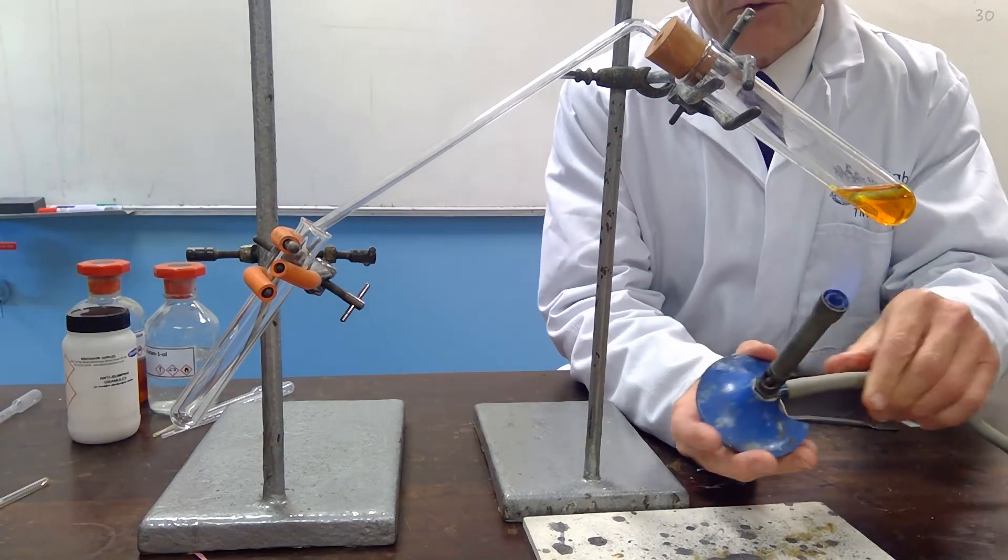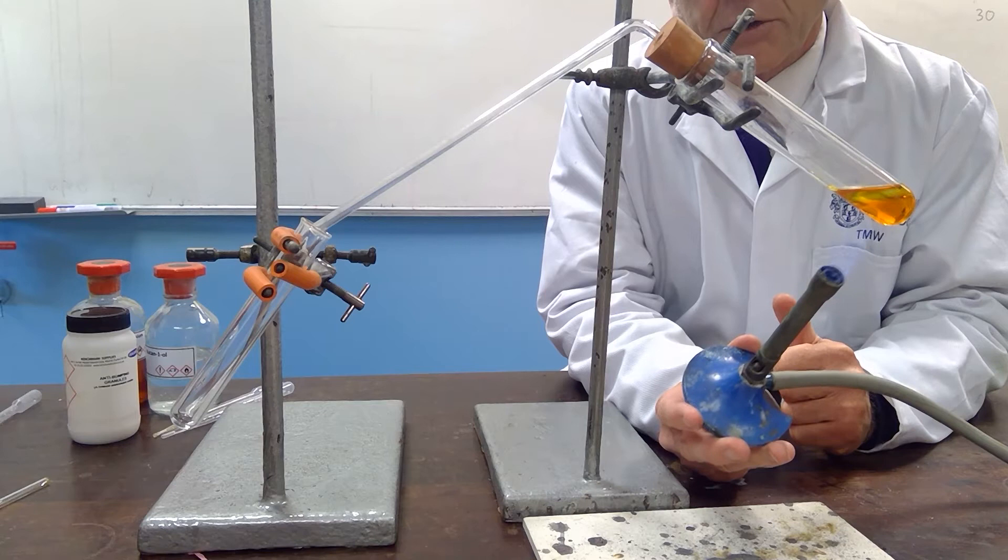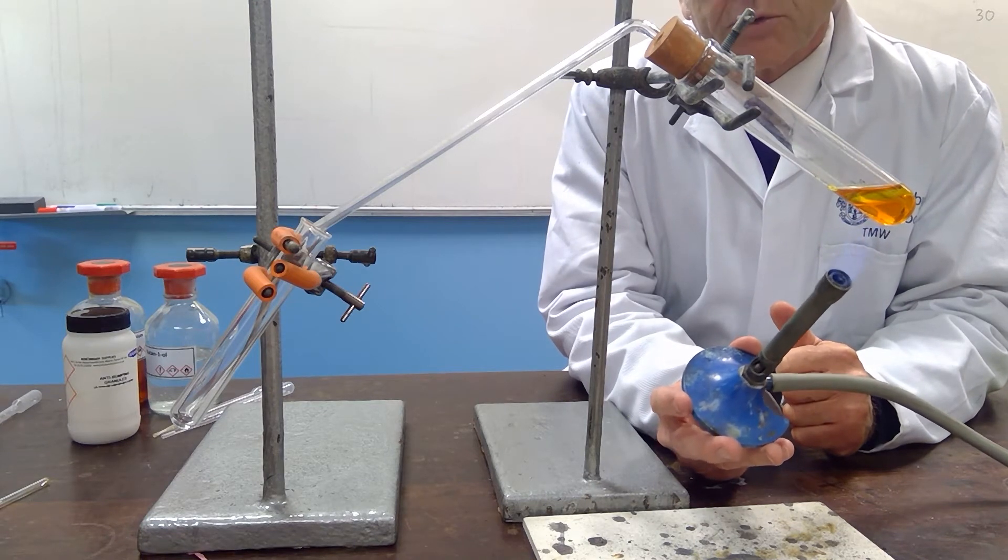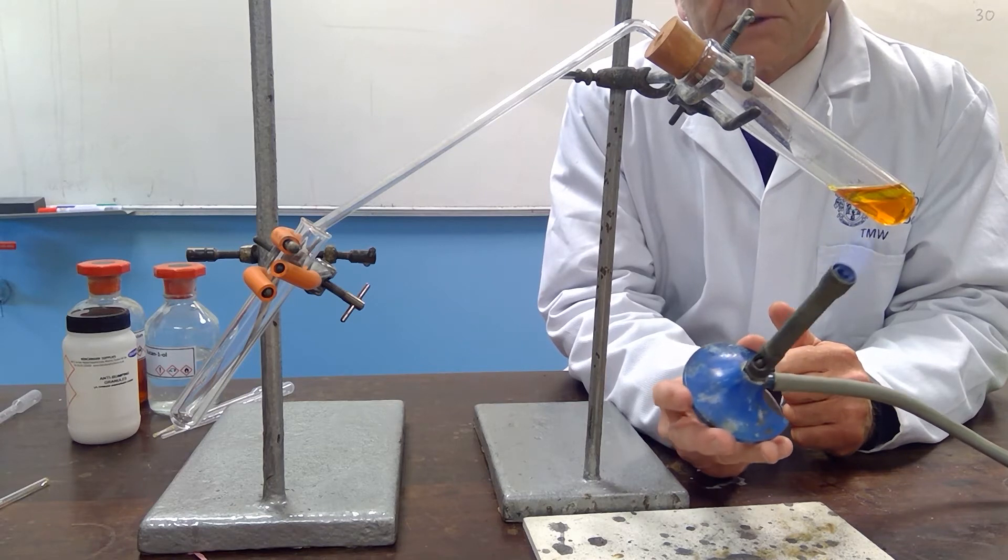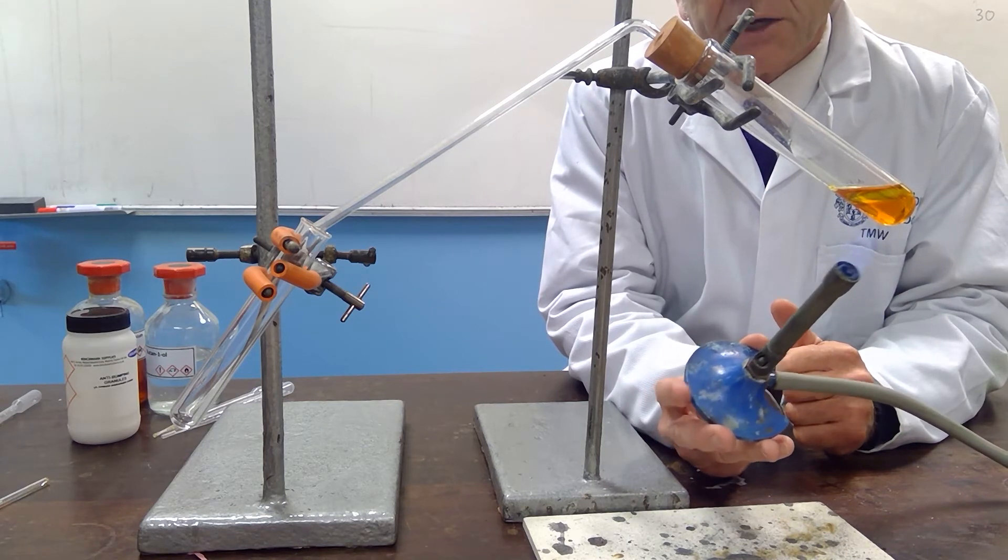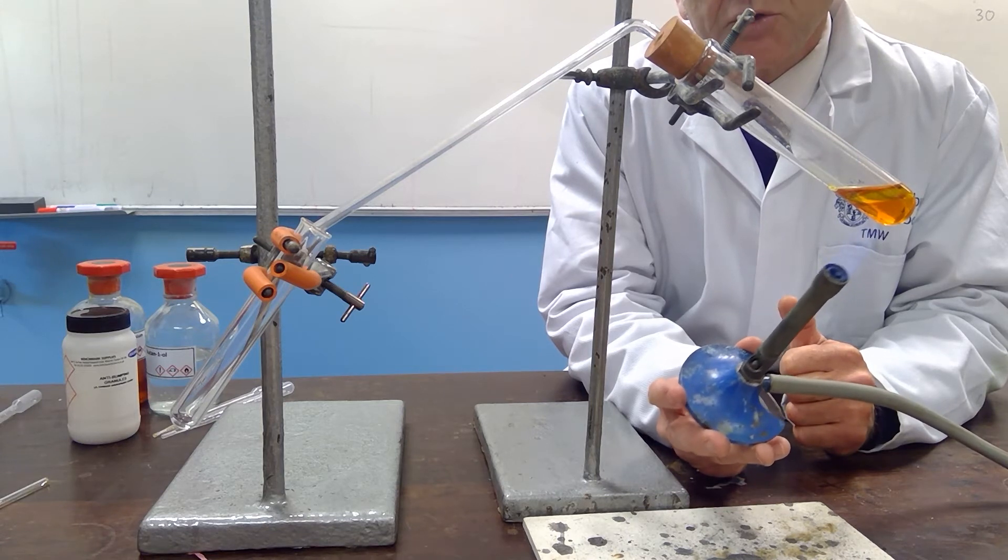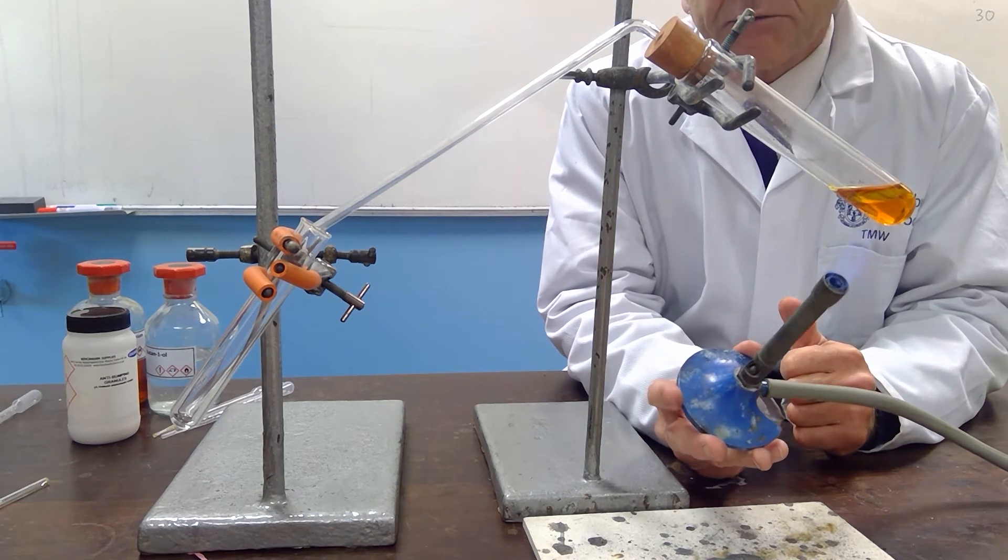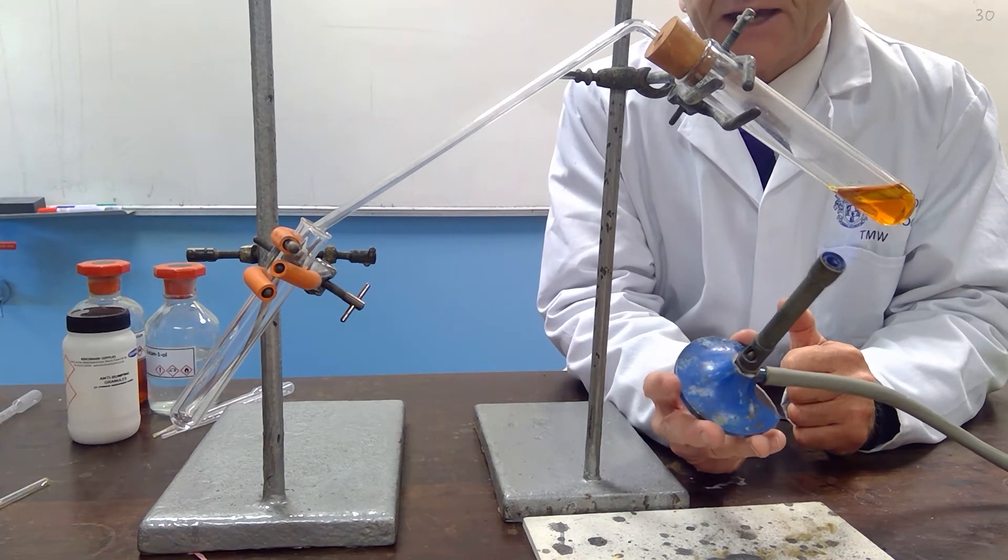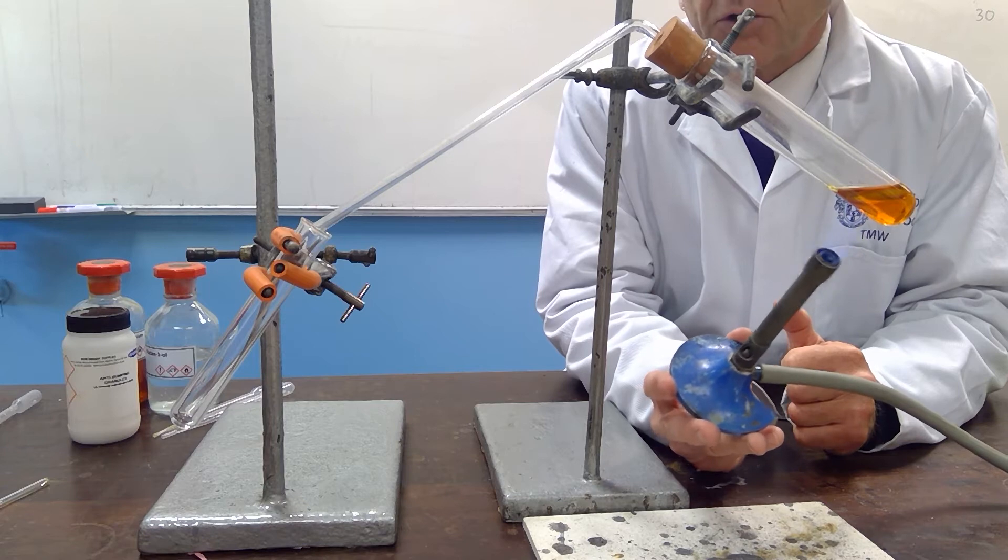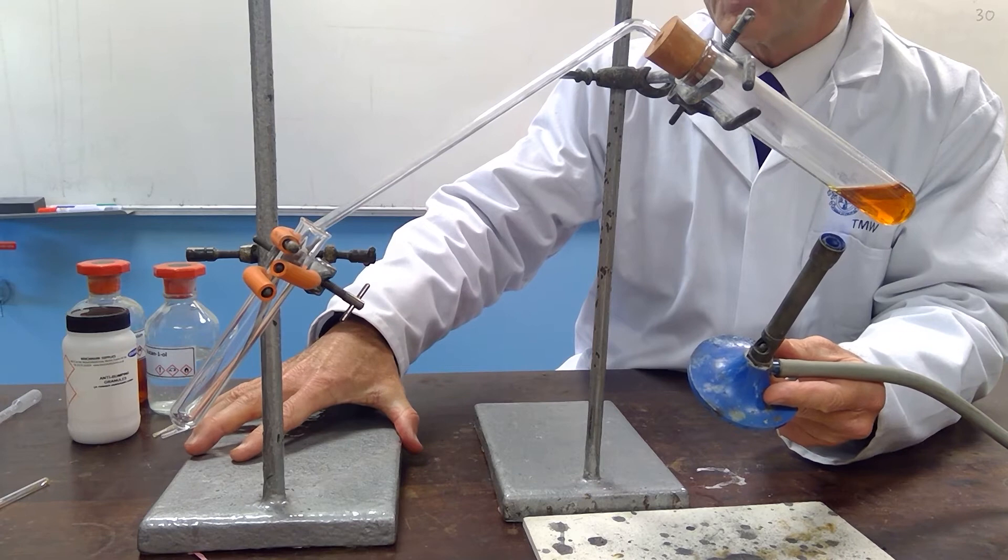So, careful heating will enable us to bring the product across. Once again, the orange dichromate will turn to green as this is warmed, and the butan-1-ol will be oxidized, first of all, to butanal. And because butanal has a relatively low boiling point, it will form a gas. That gas will pass across through the delivery tube, and we should be able to collect the distillate on the other side.